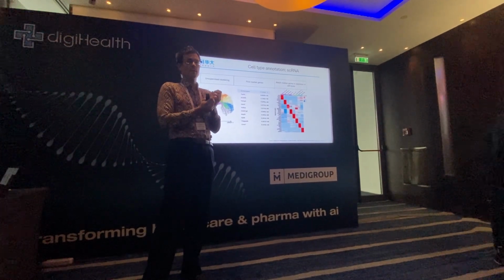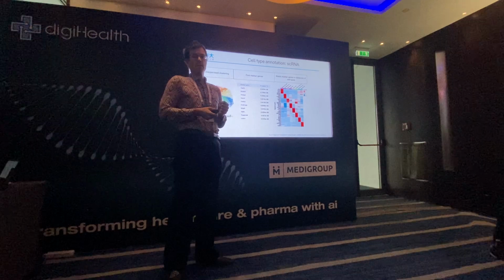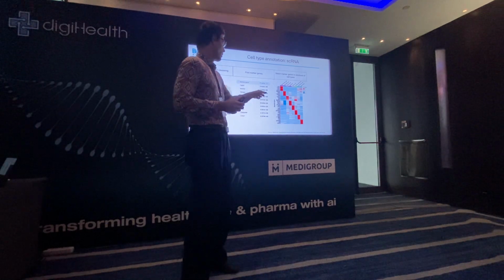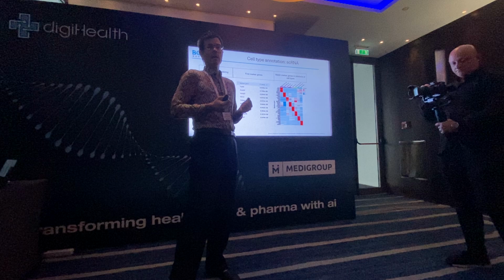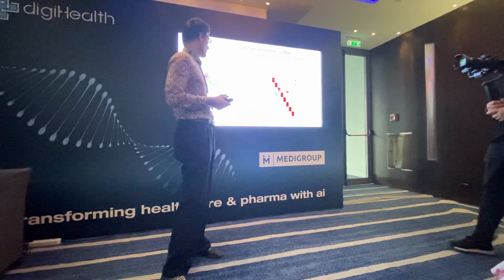So which genes represent this cluster. And based on that genes, you would search existing databases of cell types to find the closest match. And you would assign this closest match to the cluster that you identified. And that's the flow for obtaining cell types in single cell RNA-seq sequencing.